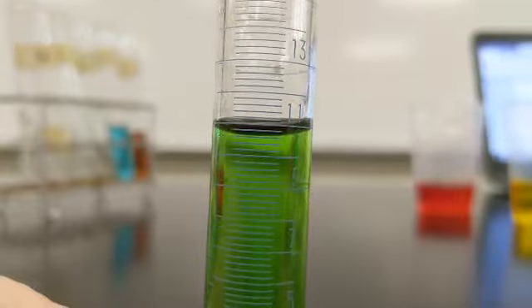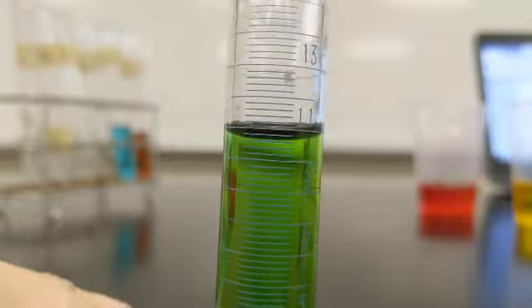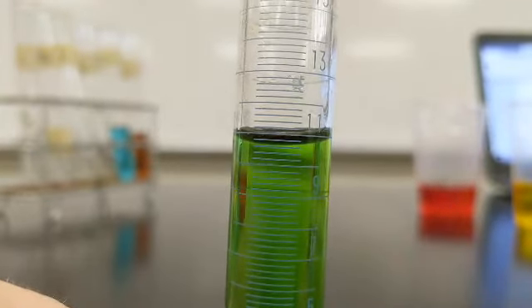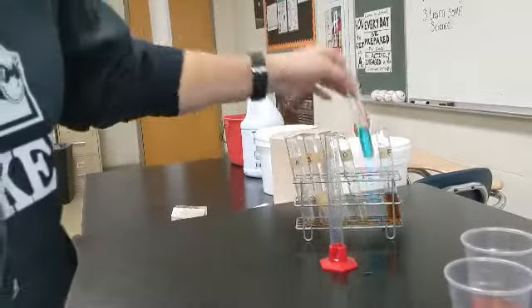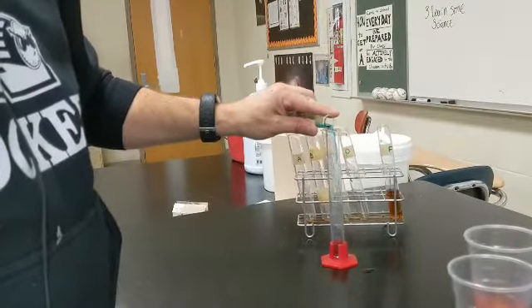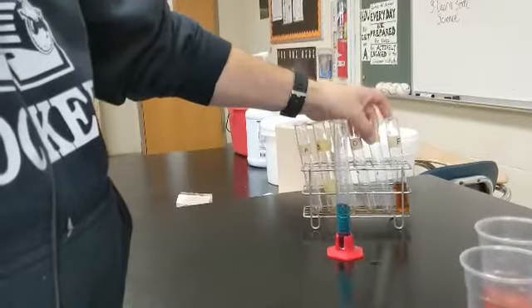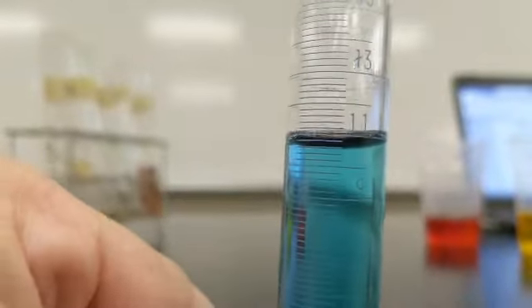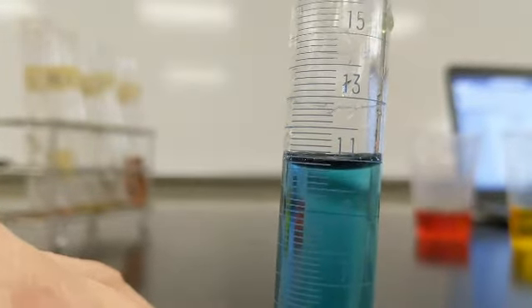Okay, and D, if we're measuring to the bottom of the meniscus, that looks like 10.6 milliliters, 10.6. Here comes E. We'll call that one 10.6 as well.